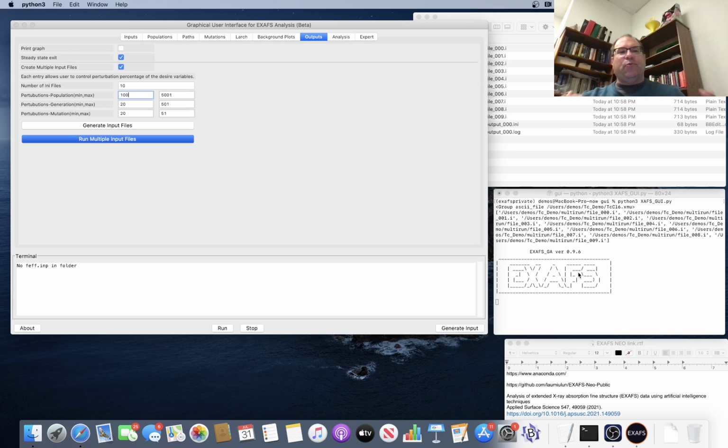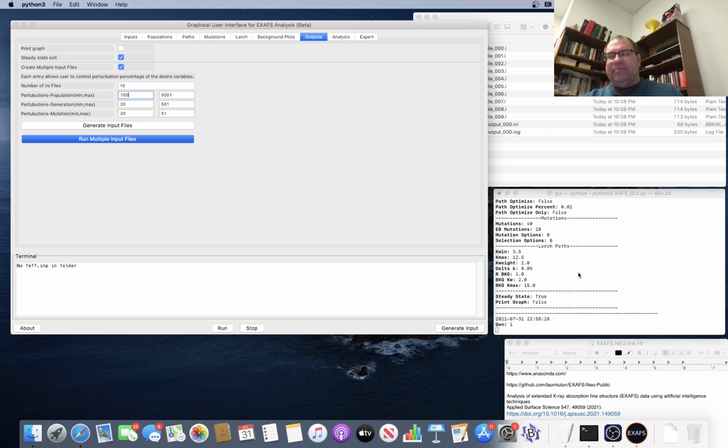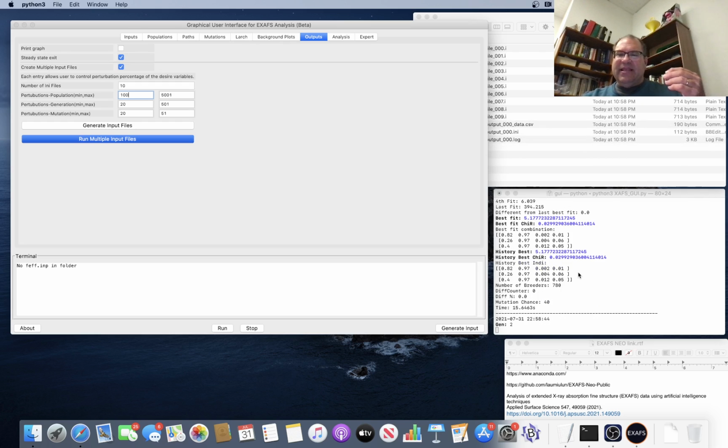Now, because there's a wide range of populations, generations, and mutations, it can take much longer for each generation. So once you start one of these, it's usually a good idea to sit back, walk away, and take a break for a little while, because this will almost certainly take a significant portion of time.